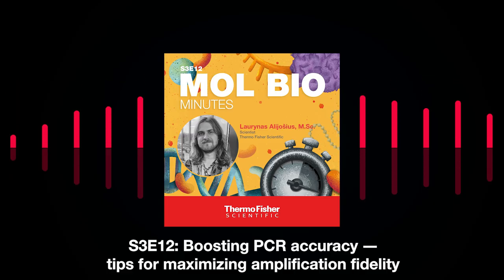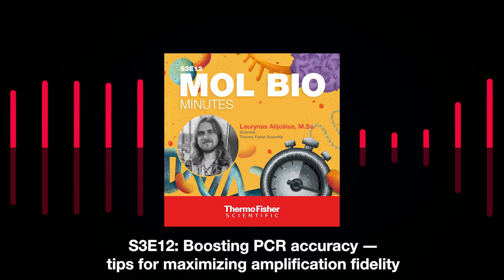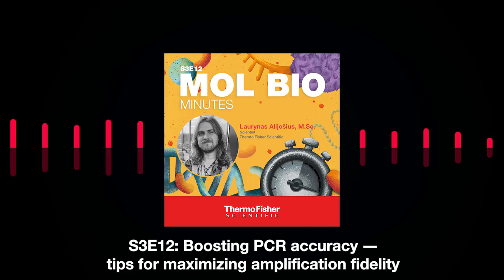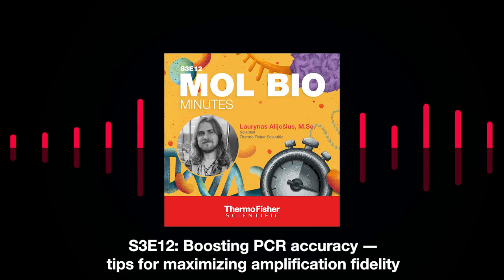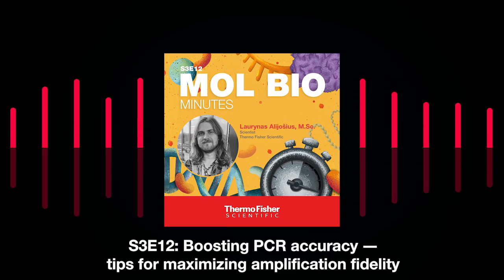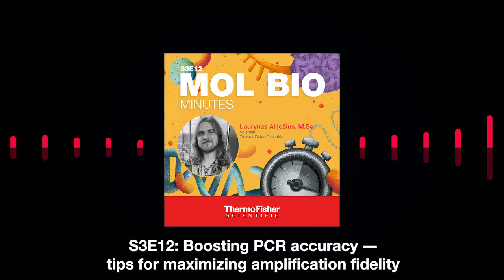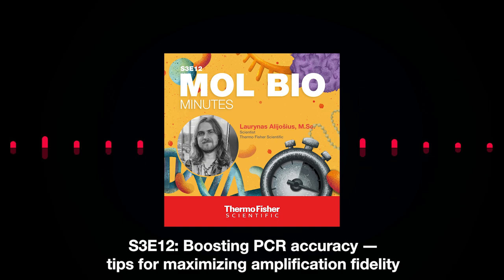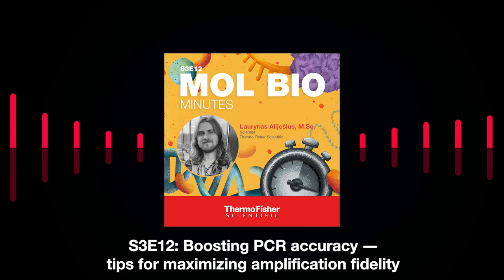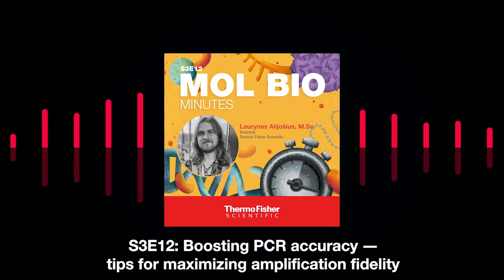In other case, if you need and choose to make your own PCR mix composition, to optimize it, you can follow the guidelines for components such as magnesium ions or nucleotides or primer concentrations for the PCR. Just remember to avoid these manganese ions that I mentioned earlier, because they can mess up the accuracy of the PCR.